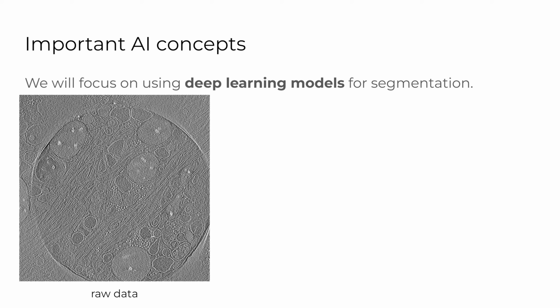Obviously, in the case of data sets that look like this, it's not easy. If you try to use the thresholding tool on this one, you're not going to get anything meaningful. It's not an easy task. But visually, you might see that for some structures, like the ribosomes that are circular, there's a pattern.